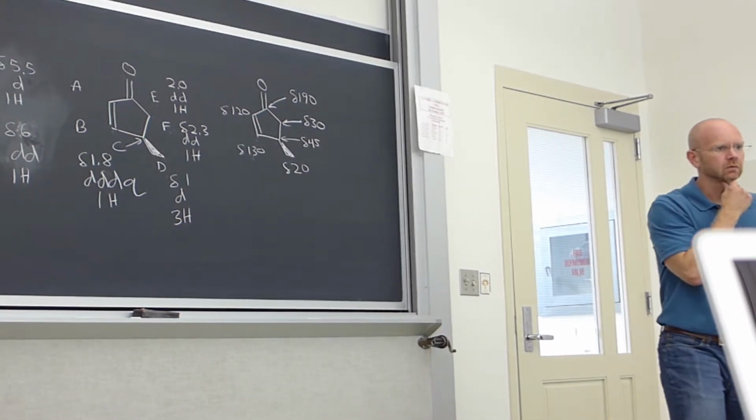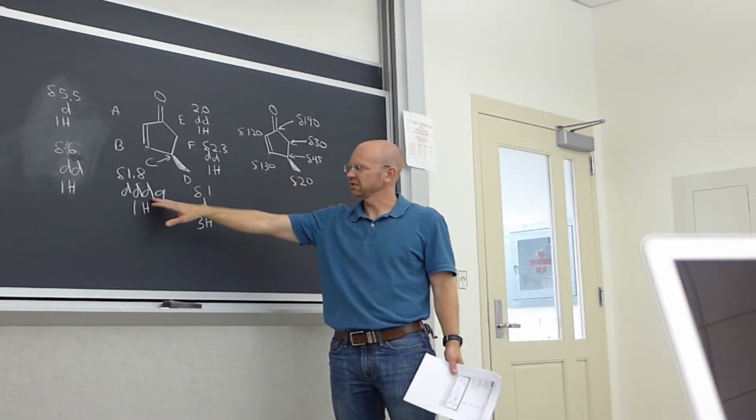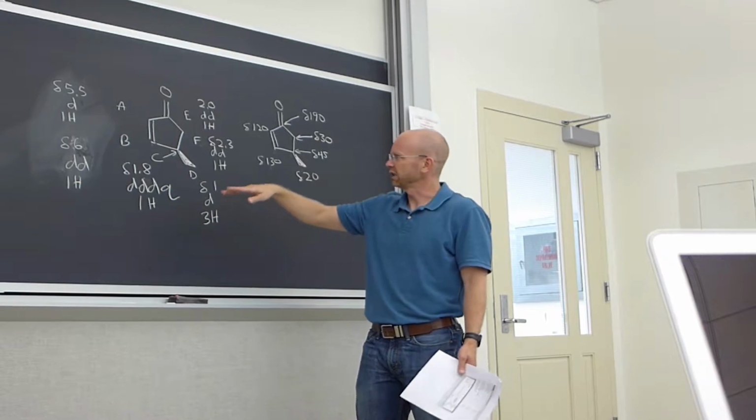Okay. If you want the H, let's just do the proton NMR, and let's just do the chemical shifts. The multiplicities are hard to read off of the ChemDraw. Let's see how we did with chemical shift. Well, first of all, number of groups. Did we get the right number of groups?